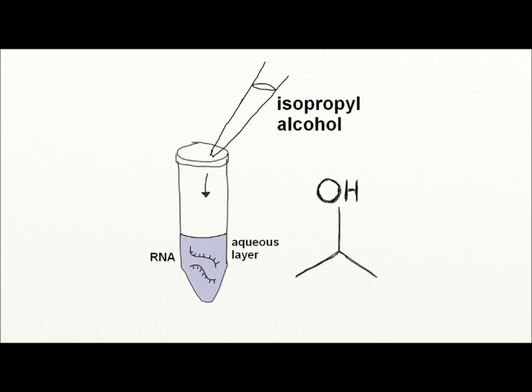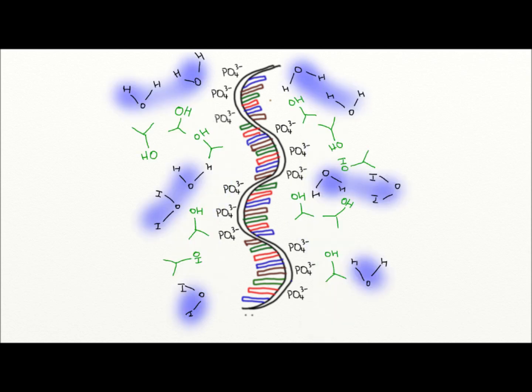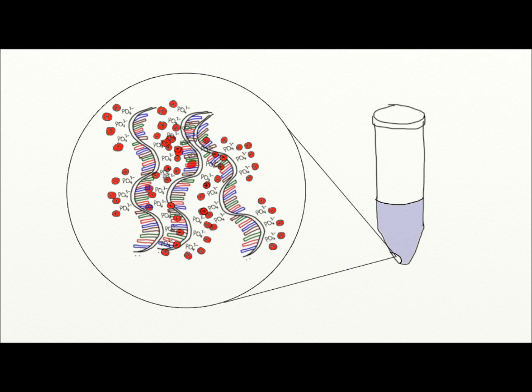Isopropyl alcohol can then be added to this aqueous layer to precipitate RNA. The isopropyl alcohol disrupts the hydration shells, neutralizing the negative phosphate backbone of RNA. Instead of water molecules, positively charged metal salt ions neutralize the negatively charged RNA. The neutral RNA begins to aggregate in the aqueous solution, following which the precipitated RNA is pelleted after high-speed centrifugation.